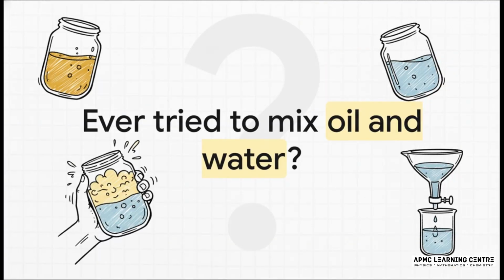I mean, you've totally seen this before, right? You shake up oil on water and for a second you get this cloudy mess. But just give it a moment and poof, they separate. Okay, so it's not really magic. What you're seeing is a fundamental principle, and it's the key to a really powerful technique in chemistry.